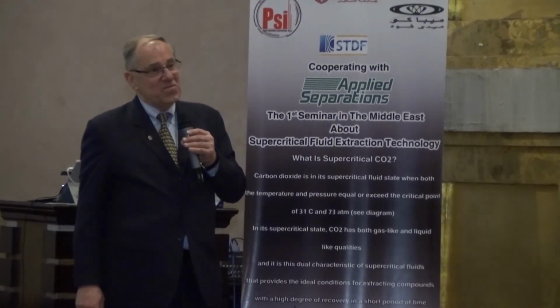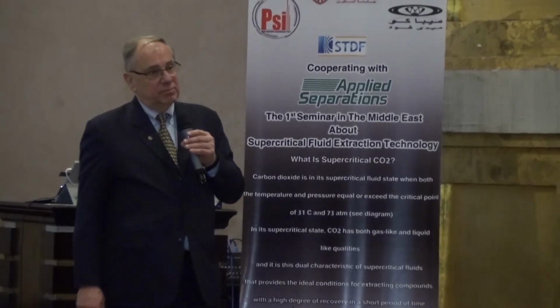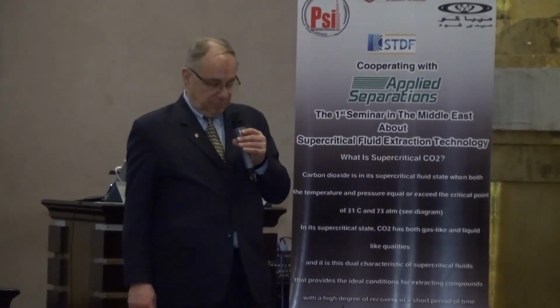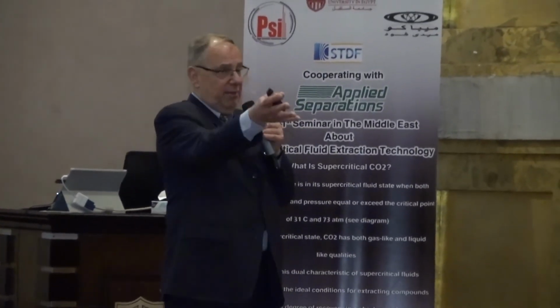And I believe to avoid all this agglomeration, you can use the technique for blending these products with others to increase the surface area of absorption and so on, from my point of view. And these post-treatment examples are perfectly valid. I absolutely agree with you.